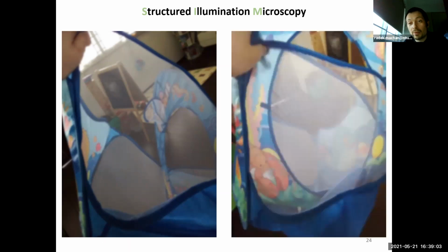But if I put two meshes over each other, then because of the aliasing effect, I can see something called moire fringes, and they have larger spacing than the original mesh. So if I know the mesh which I overlaid over the original one, I am in principle able to reconstruct the original mesh from the moire fringes.